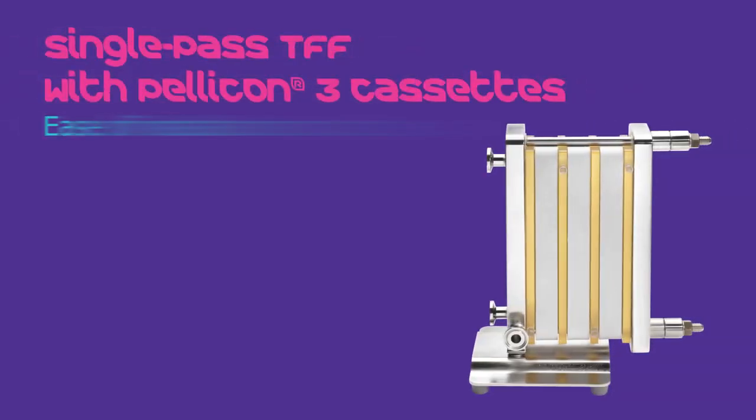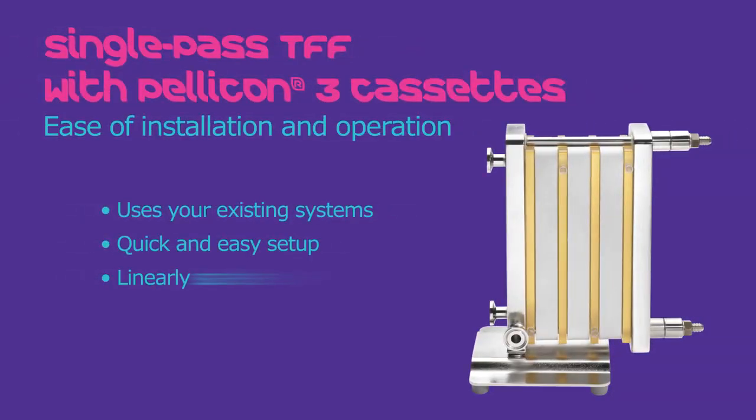In this video, we will show you how to install Pellicon cassettes into a single-pass configuration. It's fairly simple.